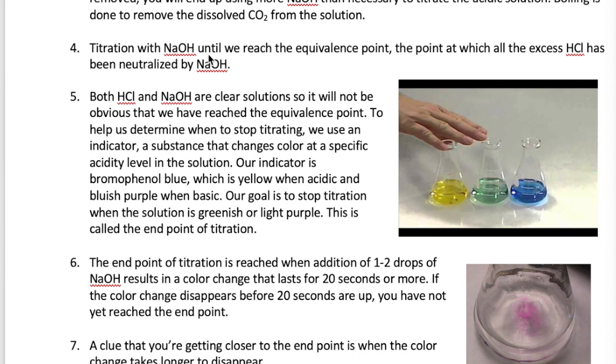Now, we want to titrate using NaOH to the equivalence point, which is just the point when the number of moles of NaOH is equal to the number of moles of the remaining HCl. Since both HCl and NaOH are colorless, we use a third substance called an indicator to tell us when to stop titrating. The indicator changes color when the titration is near the equivalence point. The point when the indicator changes color is what we call its endpoint.